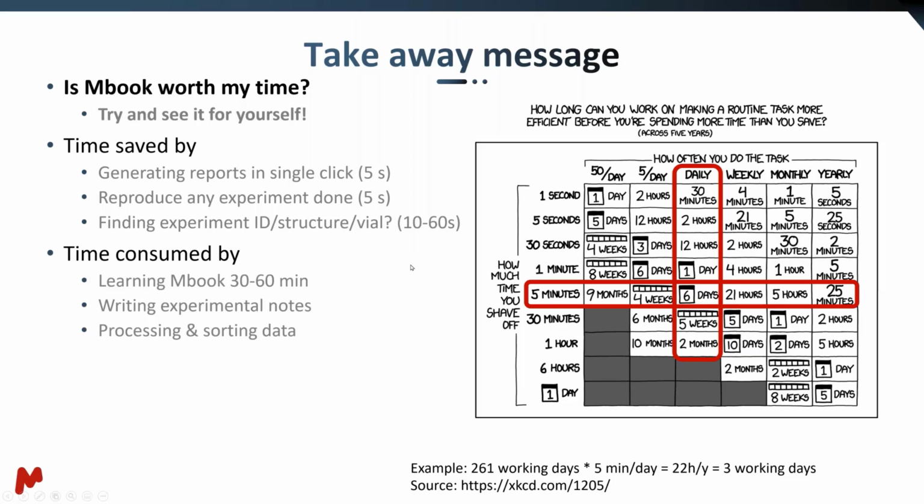What is taking time, to be fair? There's a learning curve, and we are making Mbook as intuitive as possible. So learning the basics of Mbook should not take you more than 30 to 60 minutes.